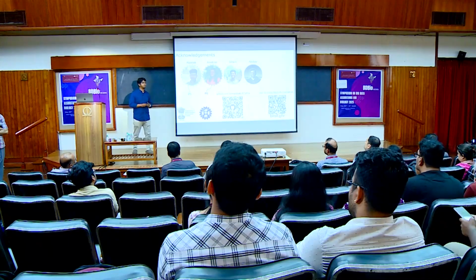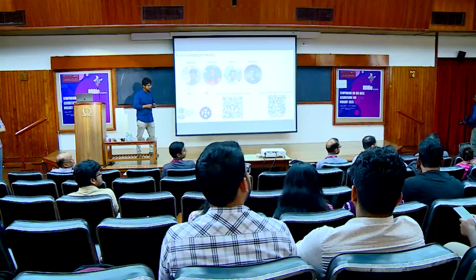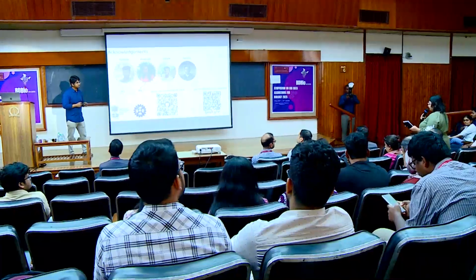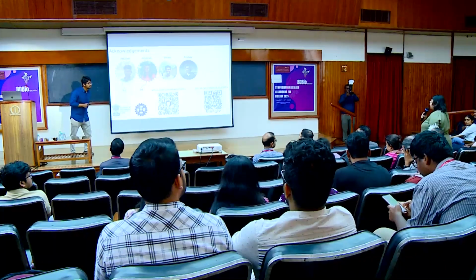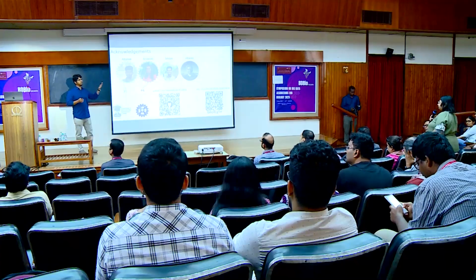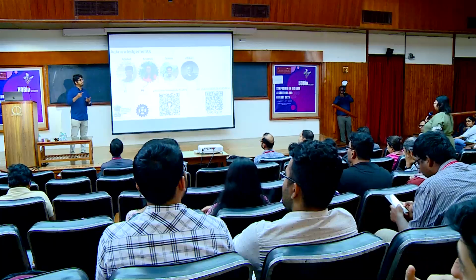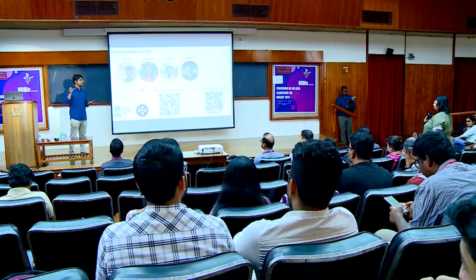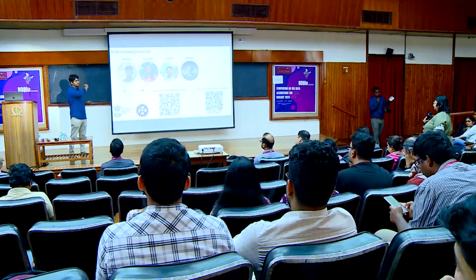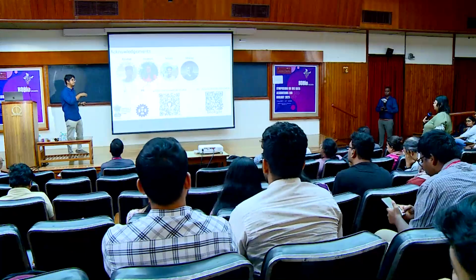Yeah. Hello, sir. Very interesting talk and very insightful. So I would like to ask, how did you check the accuracy with respect to other tools? It's the same way. So basically the ground truth is the constant for all. So now you run, with the same data, multiple tools and you take the genotypes that they give and compare the genotypes to the ground truth. Like I said, if it matches perfectly, we put it in match. If it's off by one base pair, we put it in that, and so on.